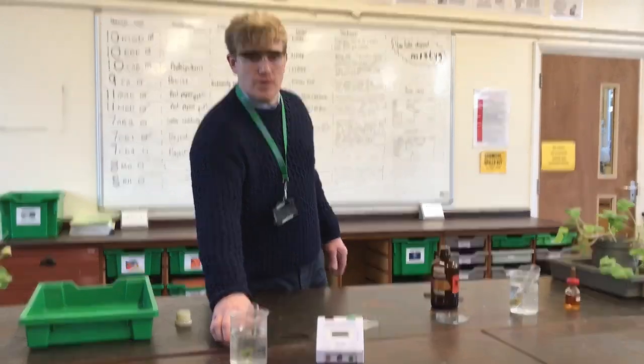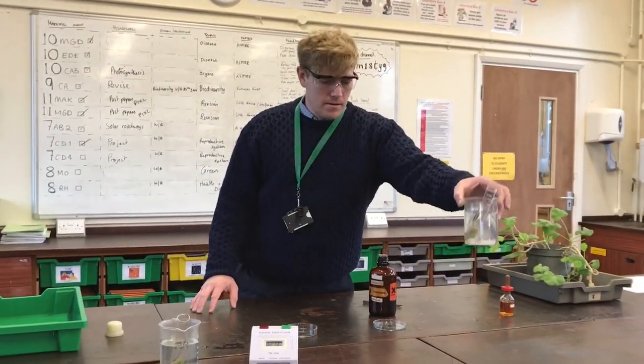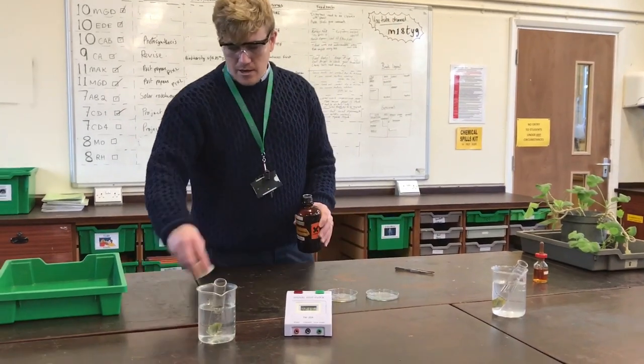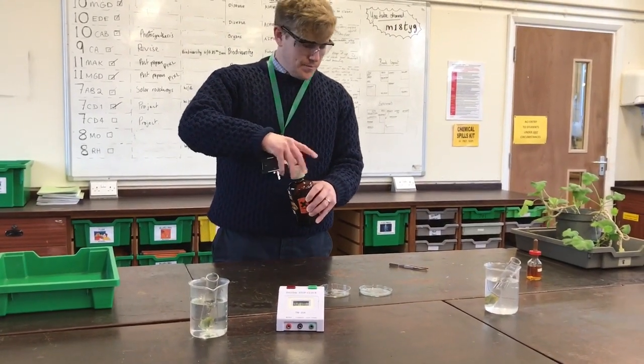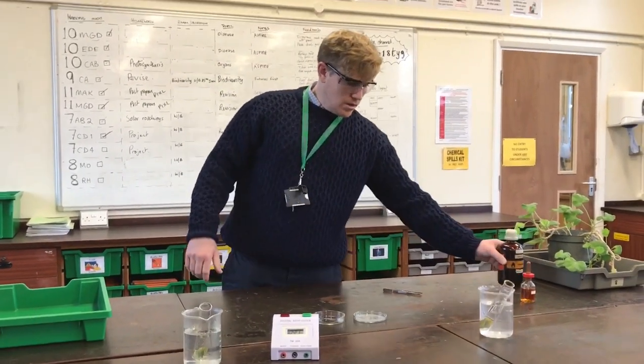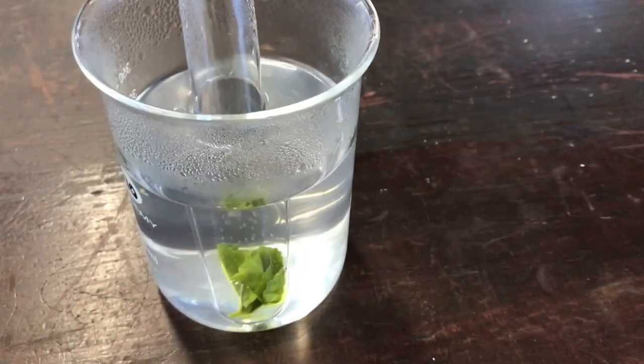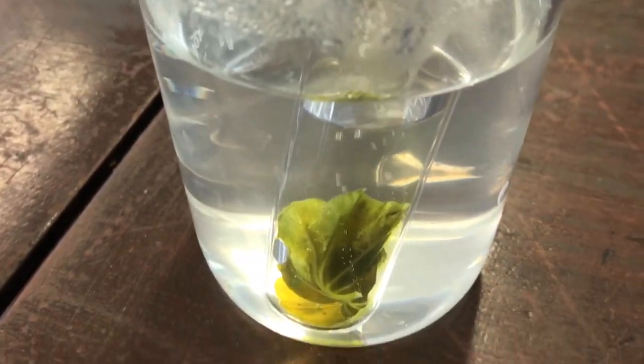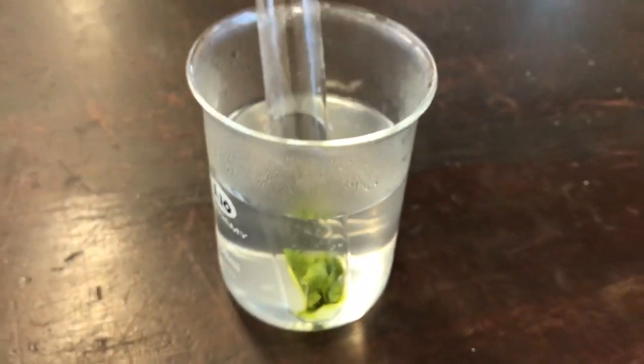The ethanol there is starting to boil. Be careful as beakers get hot. We're going to leave the ethanol boiling the leaf for five minutes — five minutes. You can see the ethanol boiling there in the boiling tube.